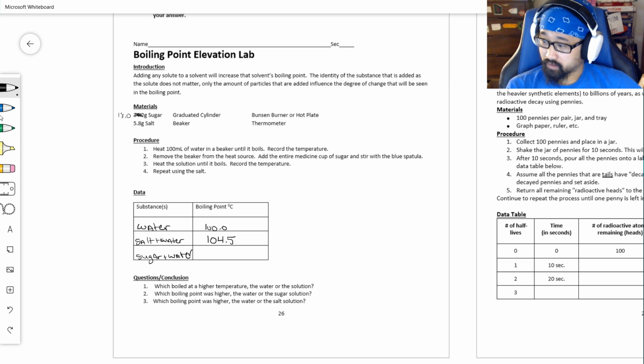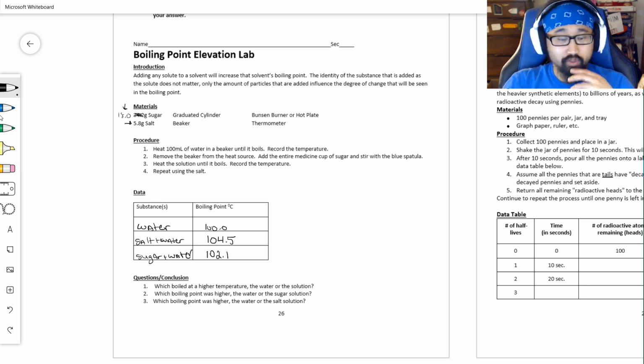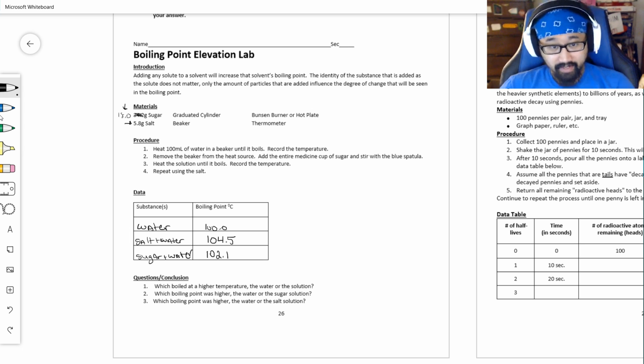So people thought, based on the fact that it was 5.8 grams of salt but 18 grams of sugar, if salt and water went up 4.5 degrees, sugar and water should go up even more than that. And that was also wrong. We found that the high mark for sugar and water was only about 102.1 degrees. This seems strange. It should, because we added more than 3 times as much sugar, 18 grams versus 5.8. 3 times as much would have been 17.4, so 18 grams is about 3.1 times as much sugar as we had salt, and somehow the temperature still didn't change as much. It changed less than half as much for the high mark.